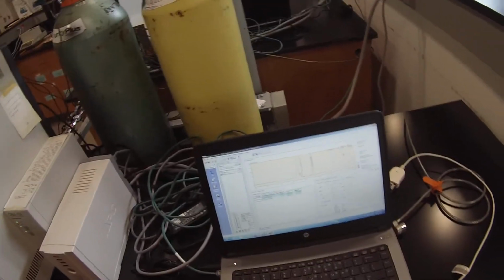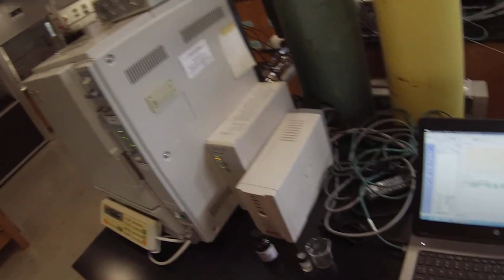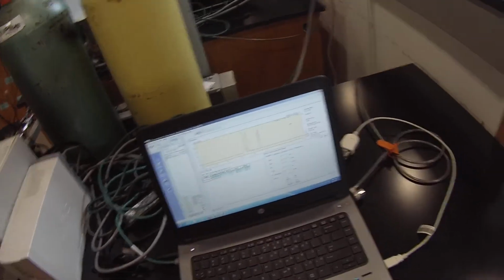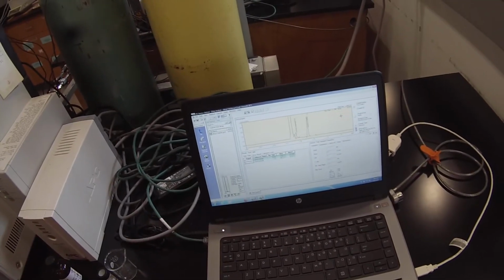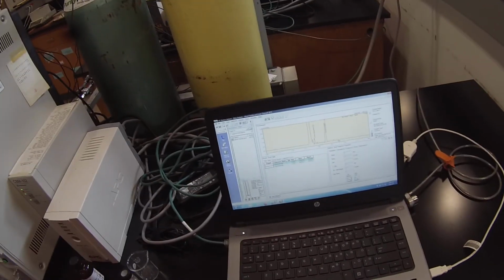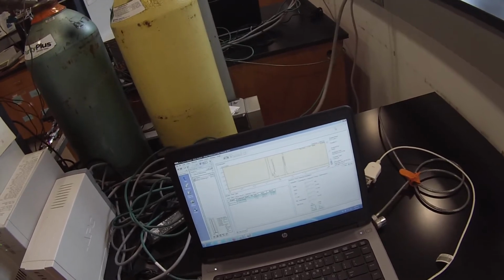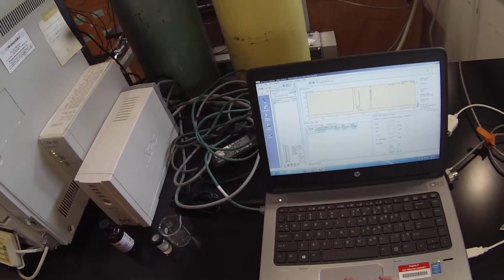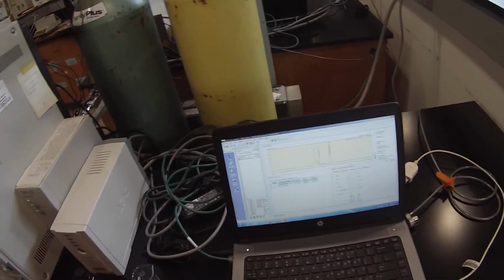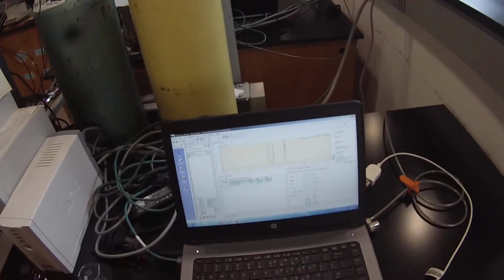So I'll have to put that in a report form. But I'm going to go ahead and do another injection to see if I can get it maybe a little bit cleaner. And because those peaks are getting close to overlapping, I'm actually going to change the temperature from 65 to 60 to hopefully slow things down a little bit, because it looks like my pressure is a little higher this year than it was last year.